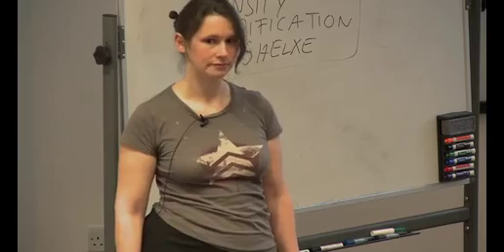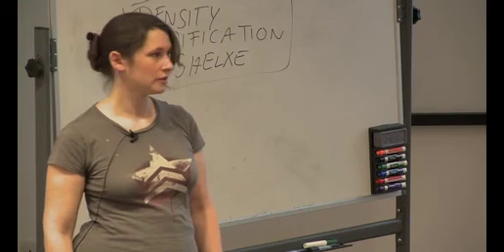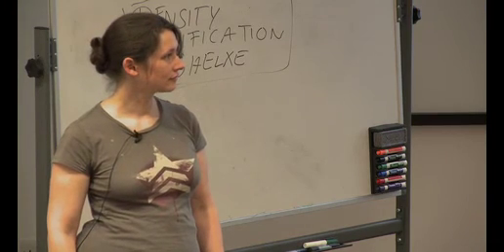Can I just make a comment about that? Right at the start, you said you go home and process your data. That's a really bad thing to do. Process your data while you're collecting it at the synchrotron. Instead of staring at it and wondering whether a correlation coefficient of 25 or 24 is good enough, just stick it into a program that can solve your structure. And if the answer is no, then collect another data set, and increase or decrease the exposure time. I think it's an extremely good point, and all tools are there.